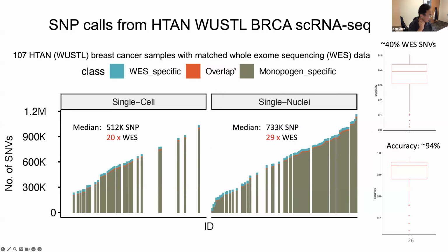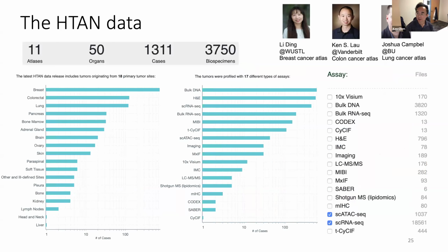Okay, there's a question, please. Yeah, it's my question. So Dr. Chen, just wondering, like, say here, there's more SNPs by using the single cell RNA-seq data. I was just wondering, what's the sequence depth for the whole exome sequence data? And I'm actually surprised there are so many SNPs we called by single cell RNA-seq data, not the whole exome sequence data. So can you actually tell us the sequence depth for each technology you have used here? Just wondering. I don't have the specific number.